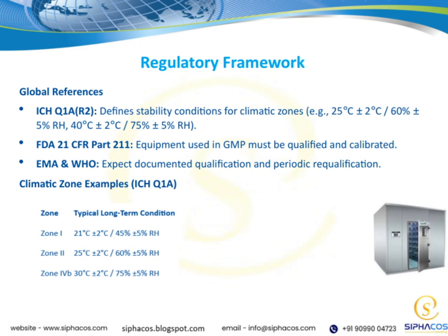Lastly, I want to highlight that these climatic zones, as defined by ICH-Q1A, serve as practical examples of how different environments influence our stability testing strategies. Recognizing these zones helps us tailor our testing conditions effectively and consistently across regions.